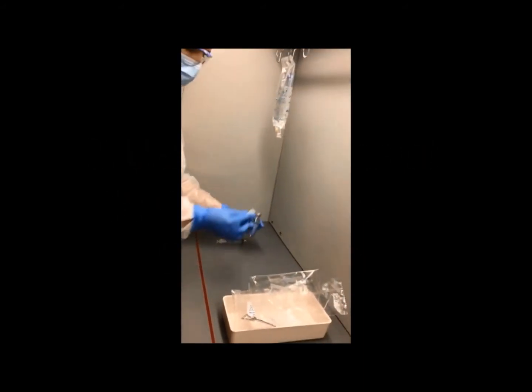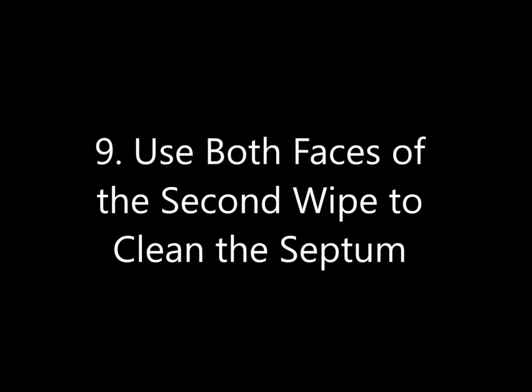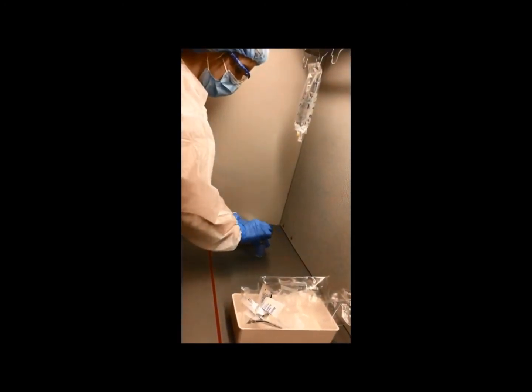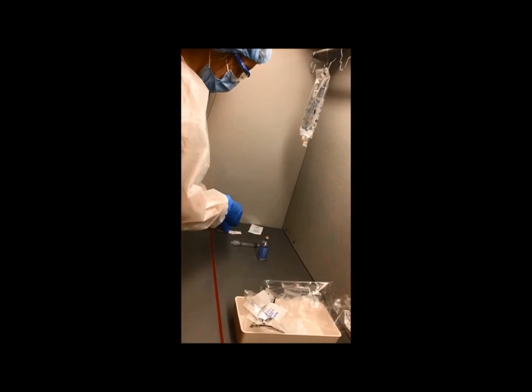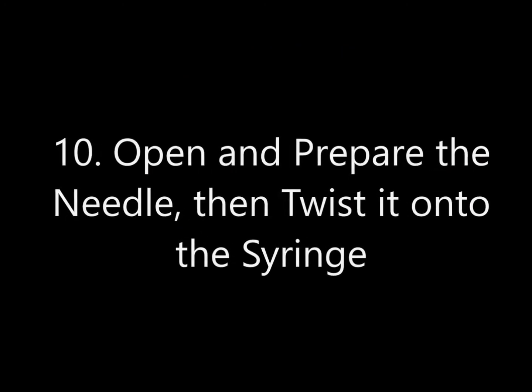Step 9: Use both faces of the second wipe to clean the septum. Step 10: Open and prepare the needle, then twist it onto the syringe.